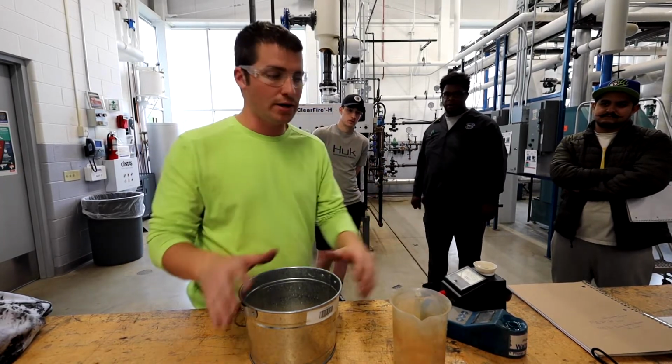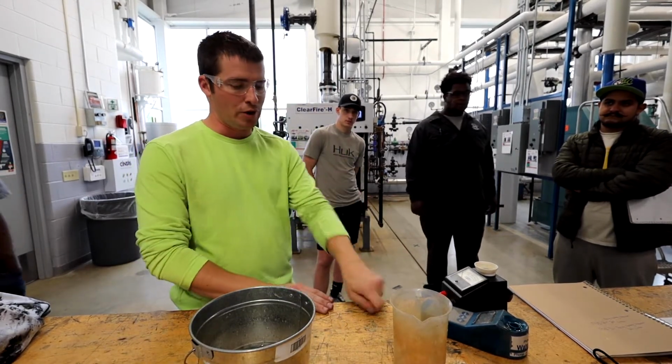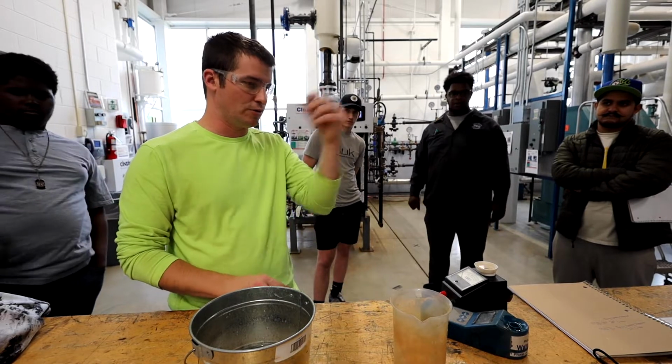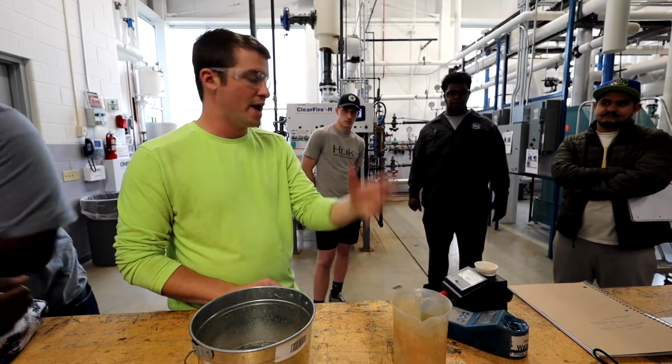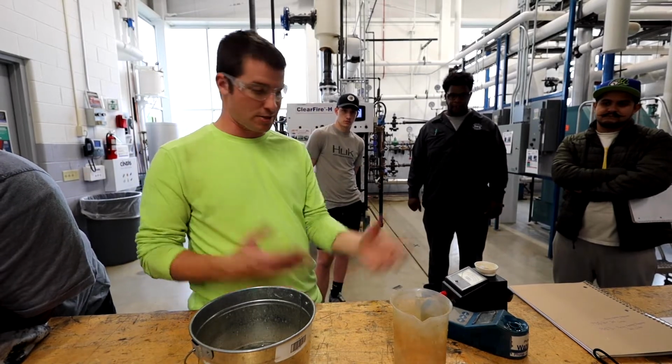All right, so we did conductivity. If we had our log sheet, I apologize that I didn't send that over, we'd write in 60, we'd say, okay, hey, life's good, right? I probably would have on there a max of, let's say, over 150, then maybe we have a problem, right? So you'd write in 60 and it'd be good, you'd move on, right?